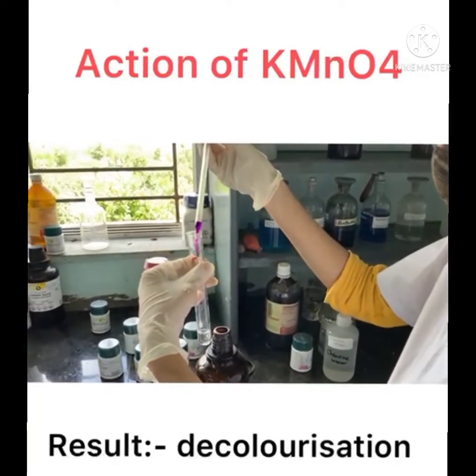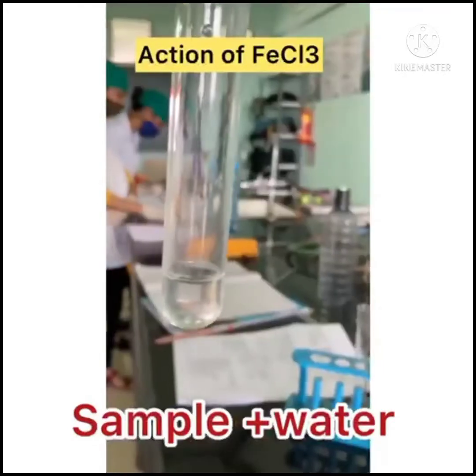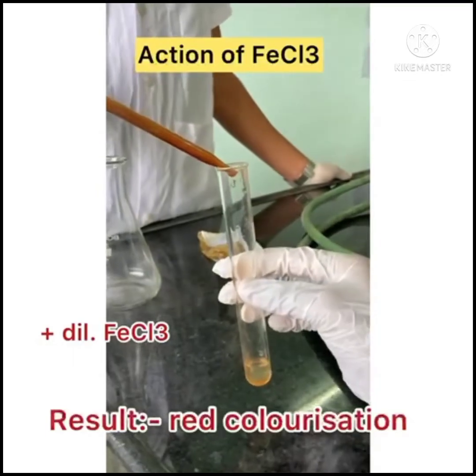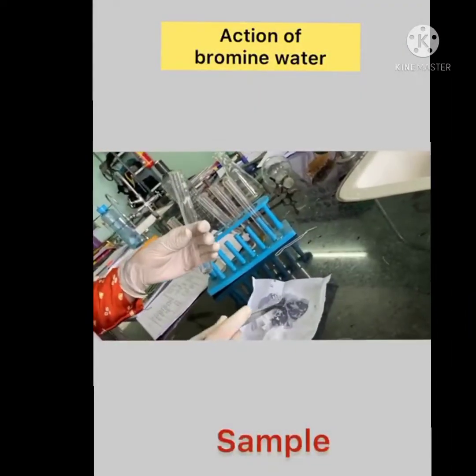The action of FeCl₃: in this test, we take a solution of the sample and add 1-2-3 drops of dilute FeCl₃ solution in a test tube, and then the solution becomes red in color.